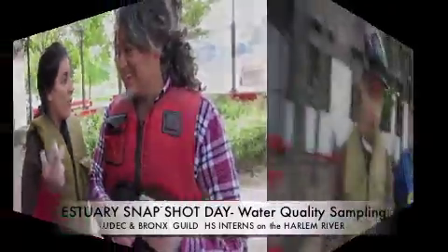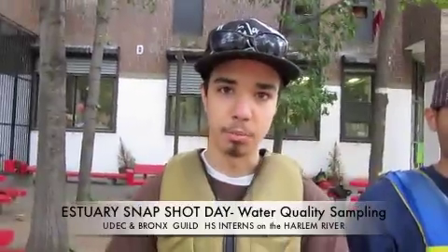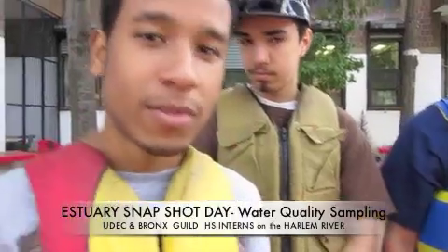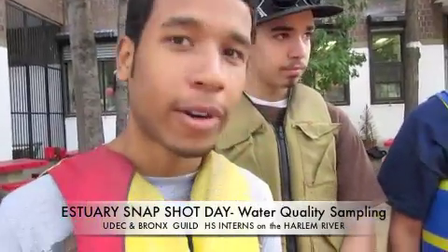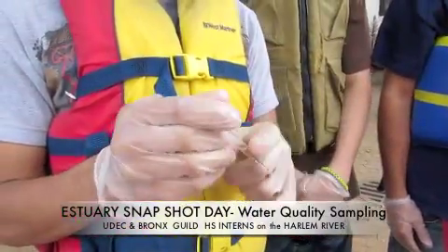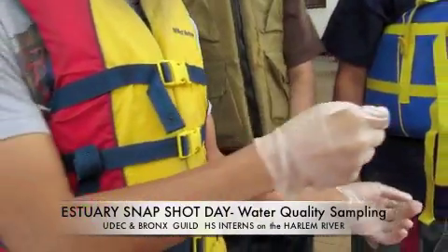That's normal. We're going to be using a colorimeter to test the dissolved oxygen in the Harlem River. Okay, and before we do that, I'm going to show you briefly how the colorimeter works. Okay, so first, there are little molecules inside that chemically react with the water that we're going to put inside right now.